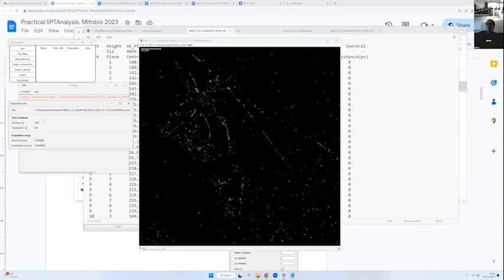Yeah, 1 second. Okay, so we are at custom. Just click on use time windows here, and we put skip line 3, and here 3, 0.2. You click here, and then time limit 0.1. You click here, and 0.1.